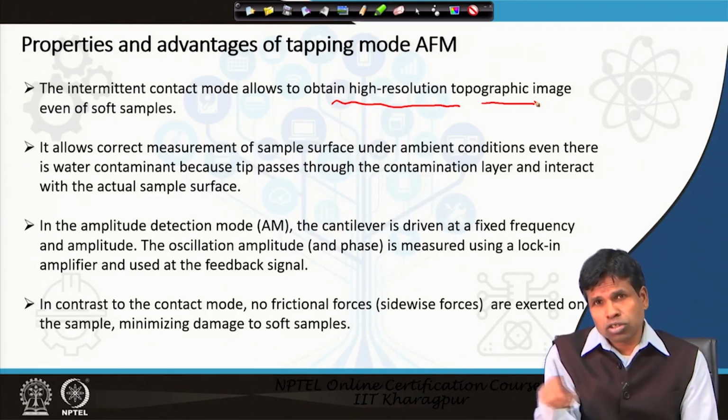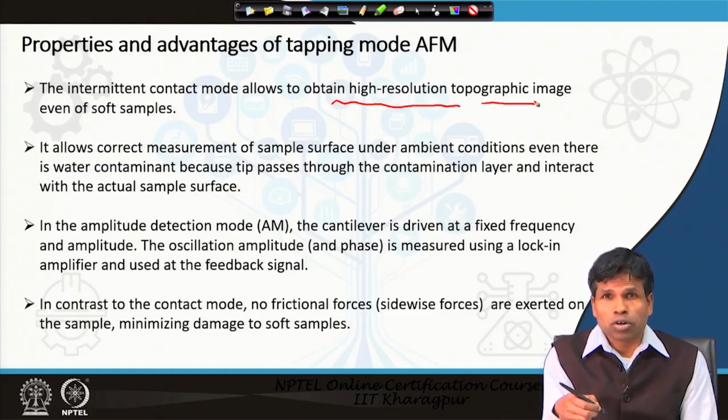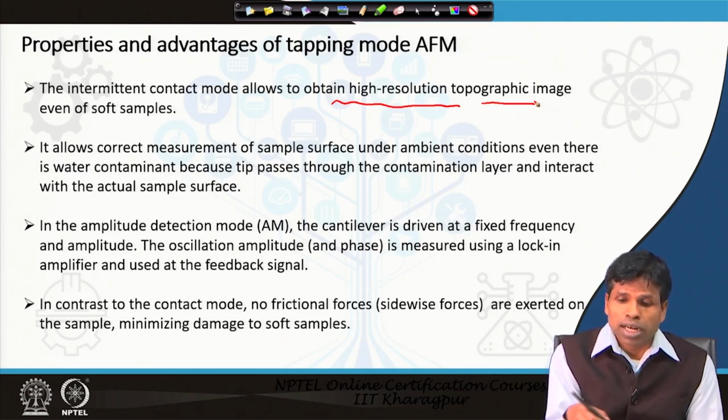In the other cases, the tip is touching. When the tip touches the sample surface, there is a chance of bending of the tip because of lateral force or frictional force, and then the image will distort and damage will occur in the contact mode. In tapping mode, this does not happen.